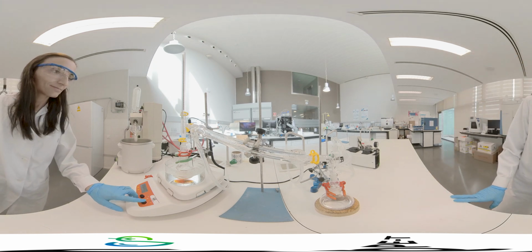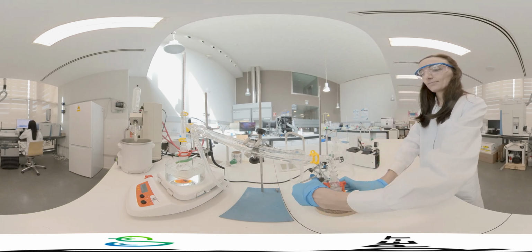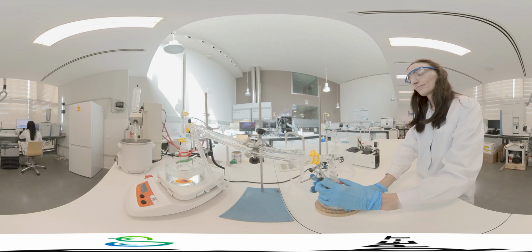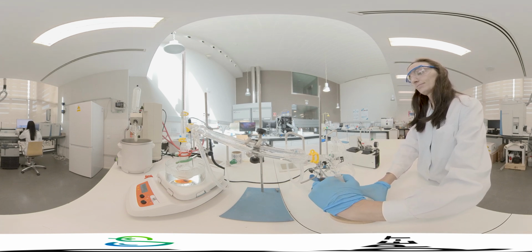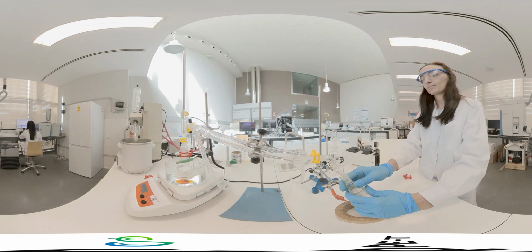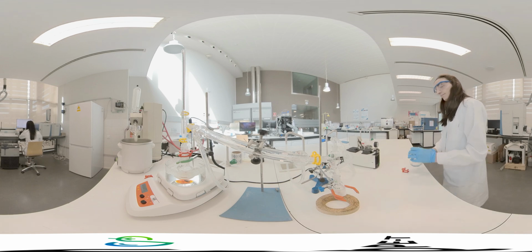First, the sample of ethylene glycol supplied by Enzymicals needs to be purified by fractional distillation. During this process, the water contained in the sample is completely removed. Then, by increasing the vacuum and temperature conditions, pure ethylene glycol is obtained, leaving the remaining impurities in the flask.